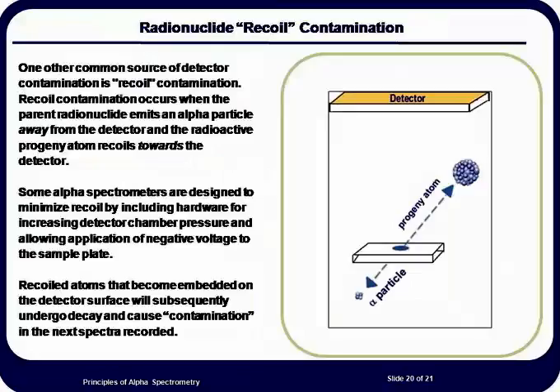Contamination can enter the chamber as a result of recoil from the sample test source to the detector surface or the vacuum chamber. This will happen to a certain extent even in the perfectly prepared sample test source. The sample chamber and detector can also become significantly contaminated if the sample test source is not perfectly dry. When the pressure is reduced, latent water in the sample will volatilize, taking some particulate sample with it, thus contaminating the chamber.